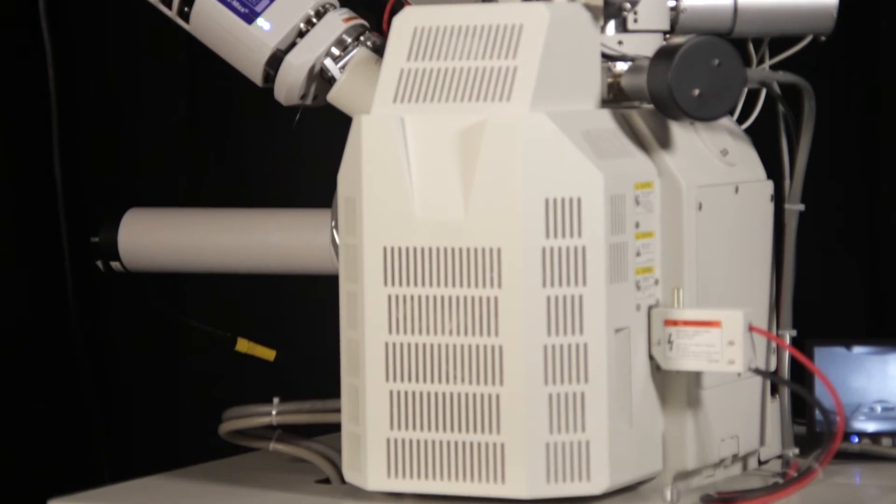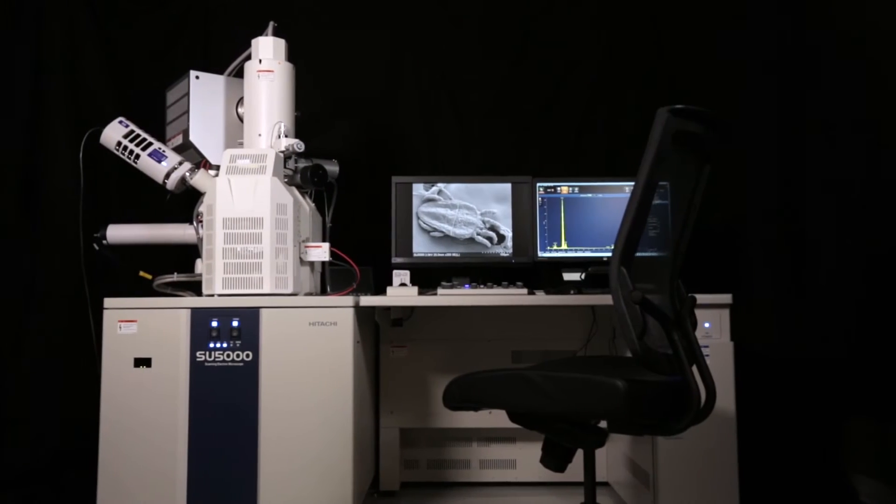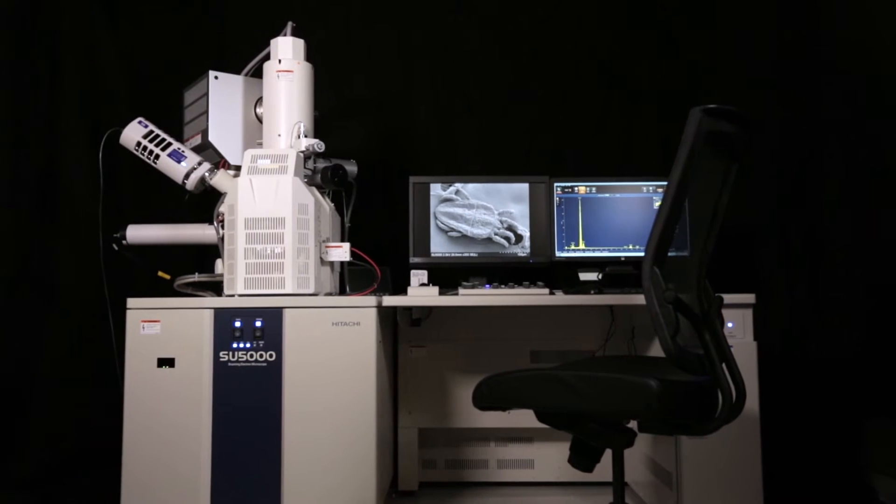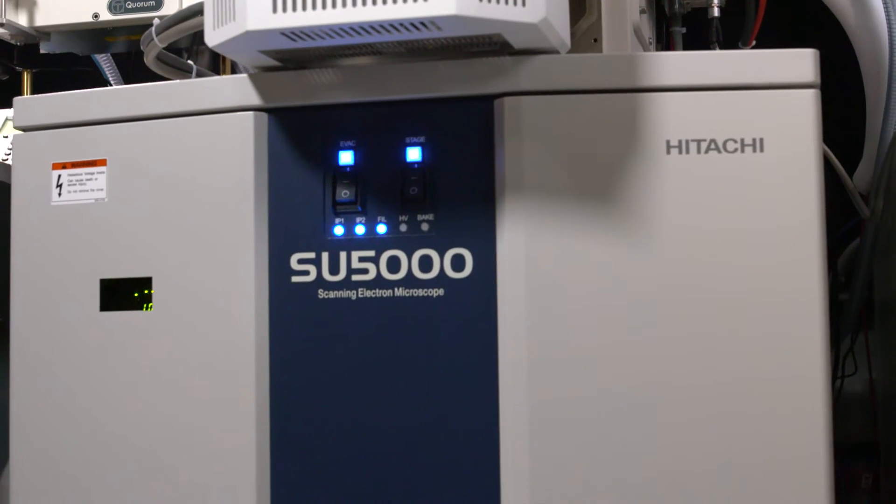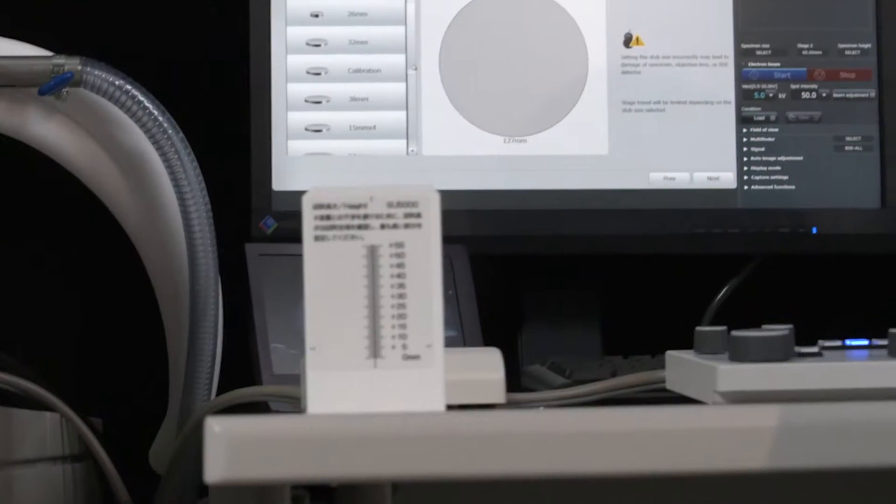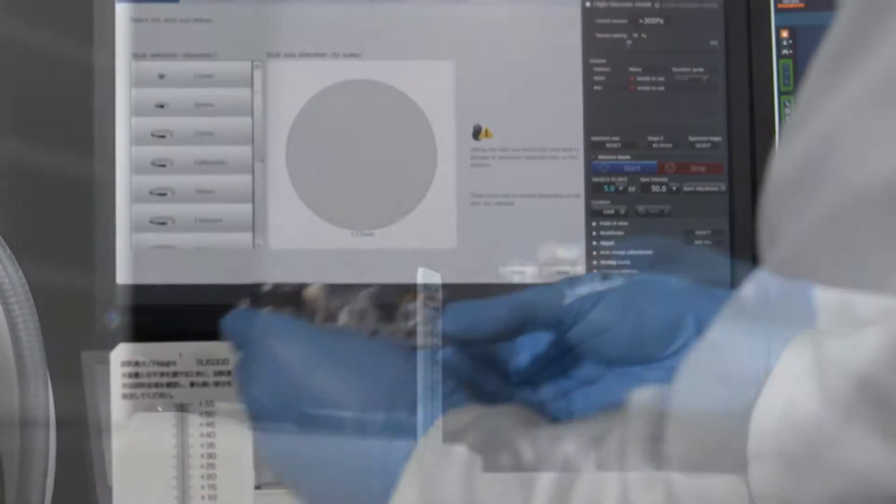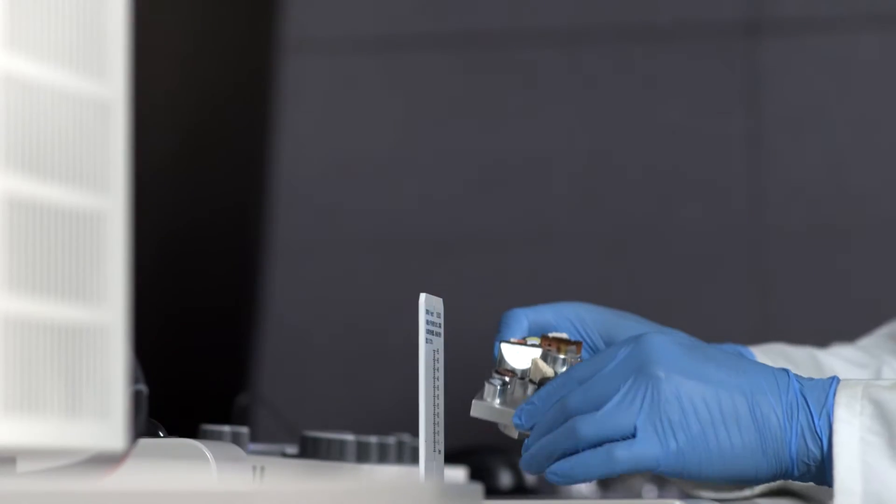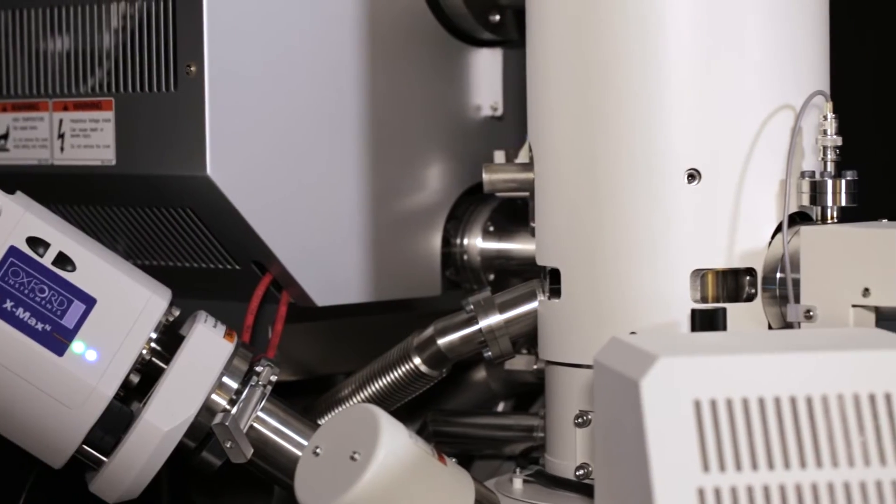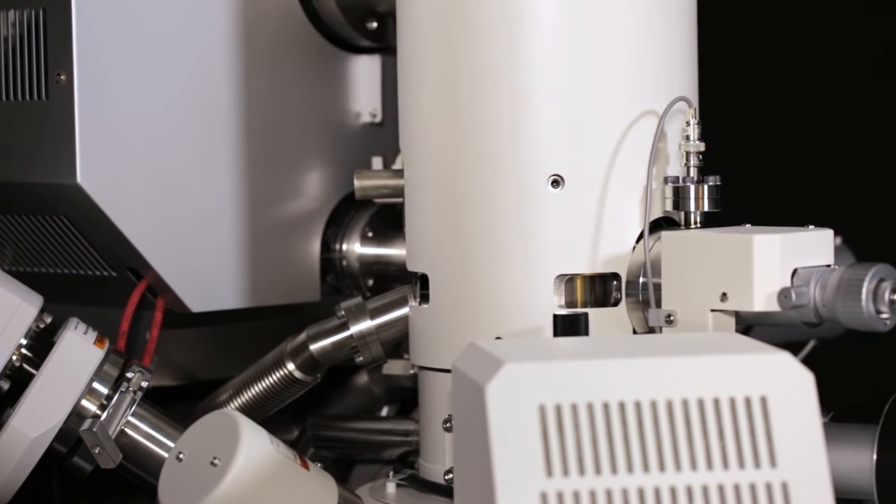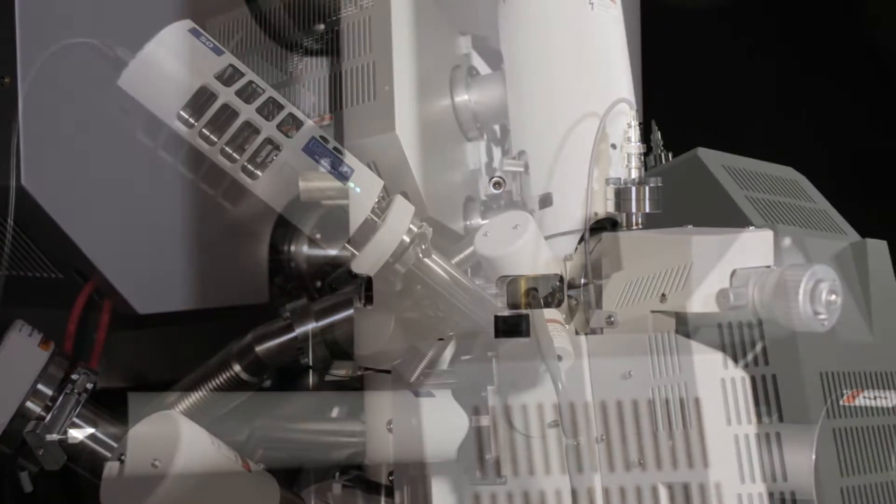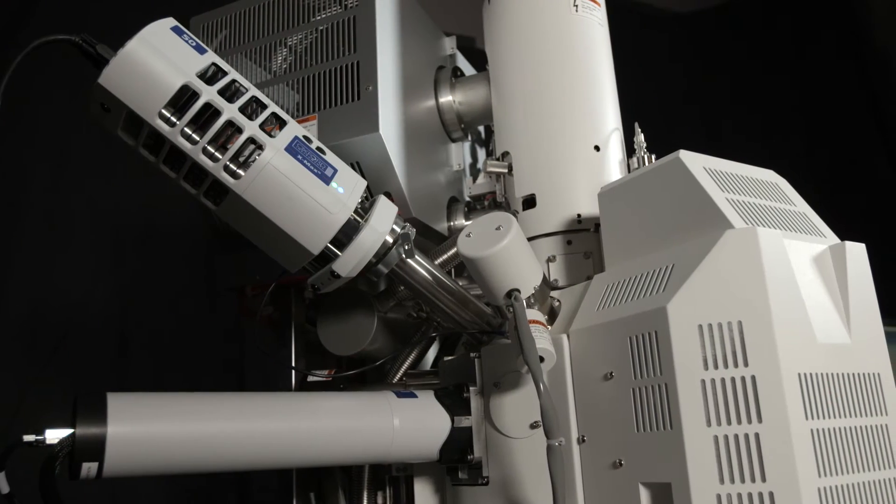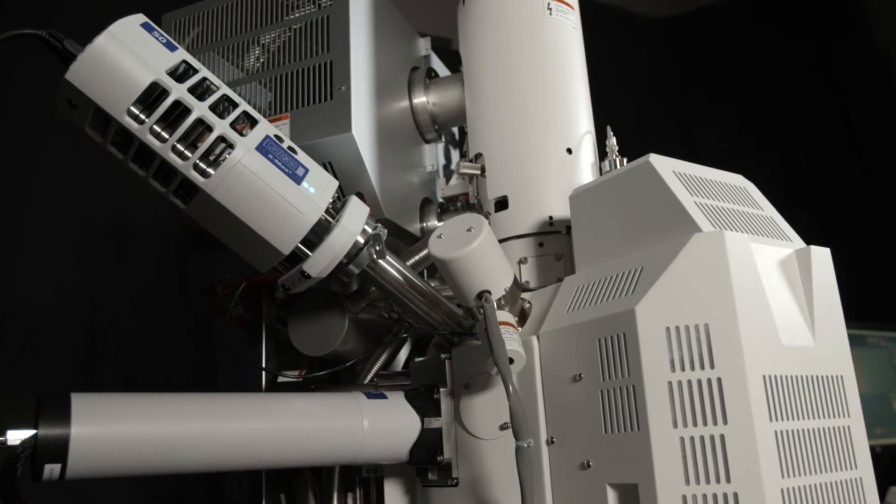The Hitachi SU-5000 Field Emission Scanning Electron Microscope, revolutionary SEM control debuts in a variable pressure FeSem. The completely new SU-5000 variable pressure FeSem features a newly designed Schottky field emission electron source, providing both high probe current and maximum beam stability.